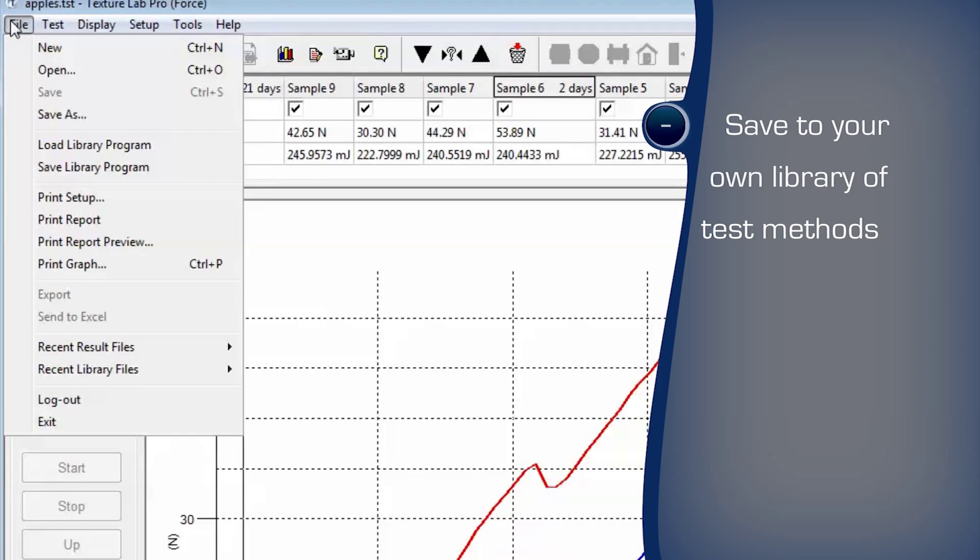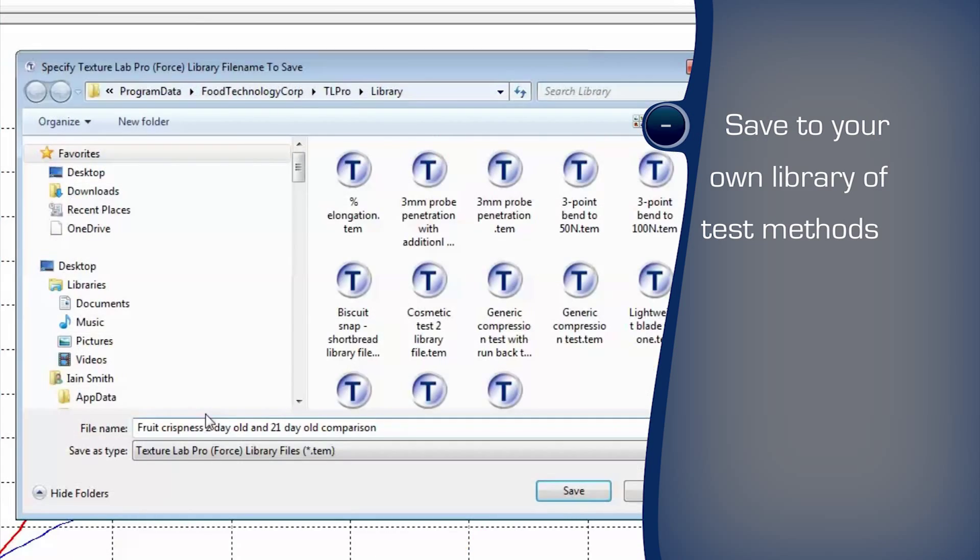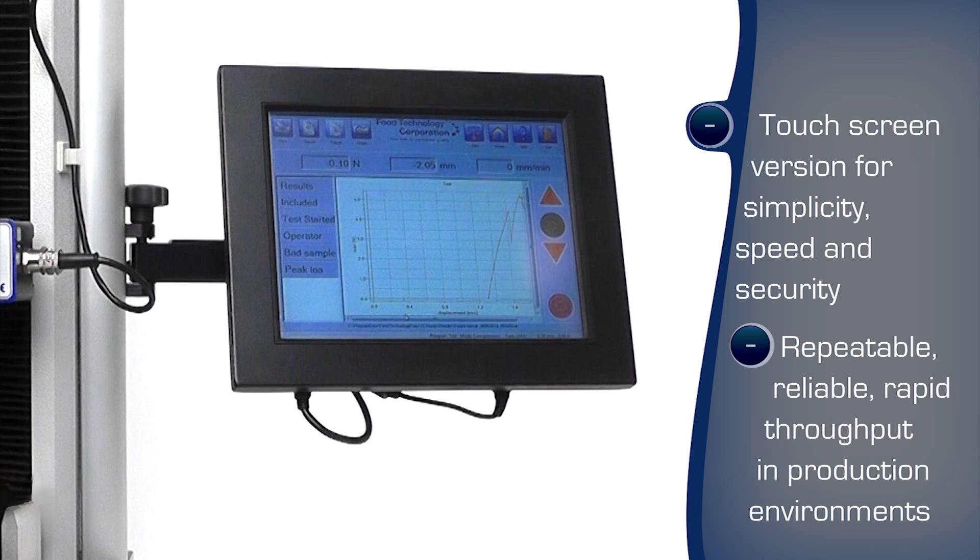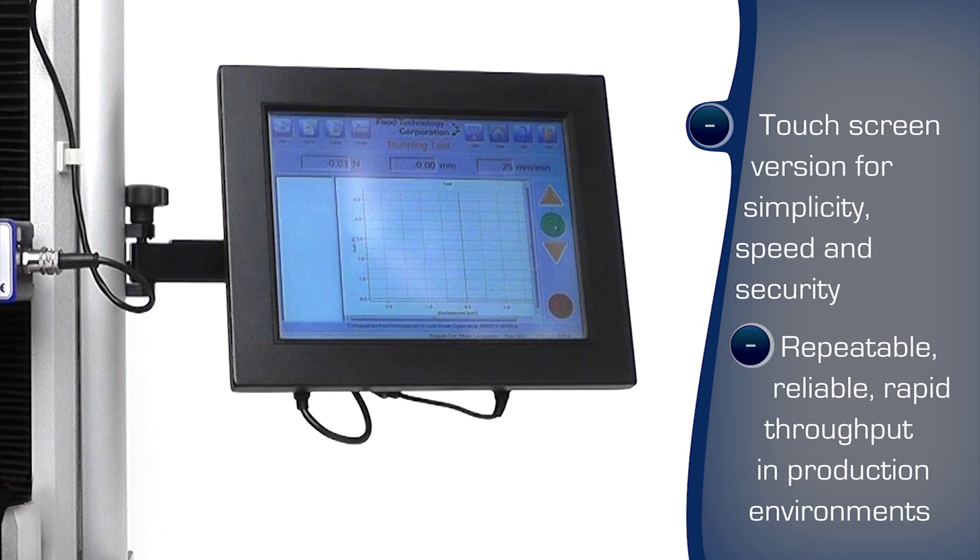The program can be saved to a library and recalled for reuse. The Touchscreen Control Texture Analyzer runs tests at the push of a button with minimal training, ideal for production areas.